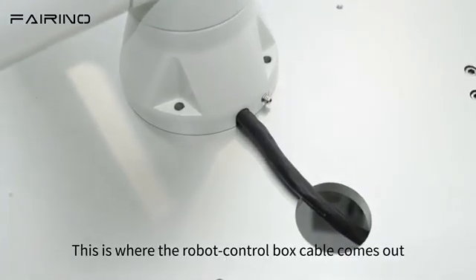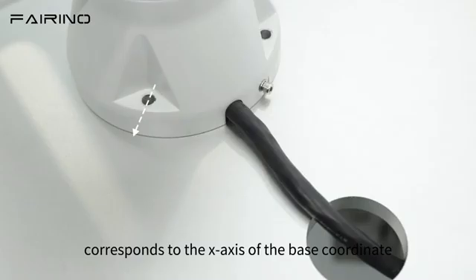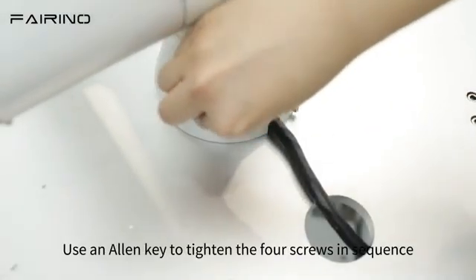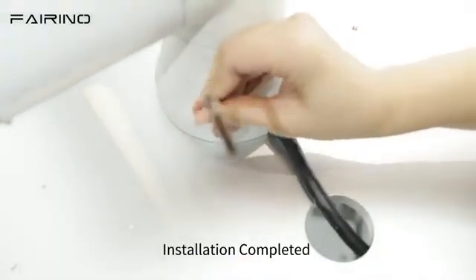This is where the robot control box cable comes out. The bolt on the left side of the cable corresponds to the x-axis of the base coordinate, and the bolt on the right side corresponds to the y-direction of the base coordinate. Use an allen key to tighten the four screws in sequence. Installation completed.